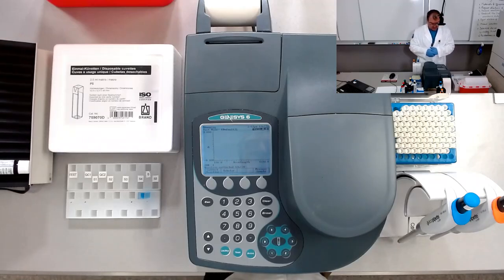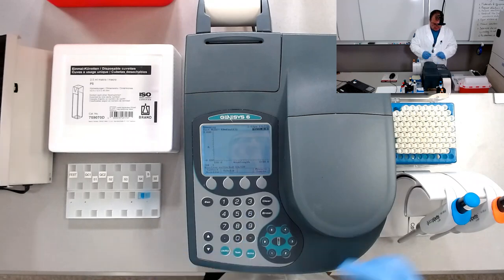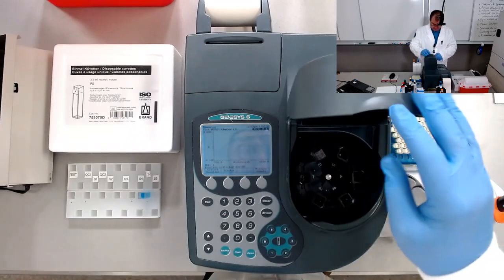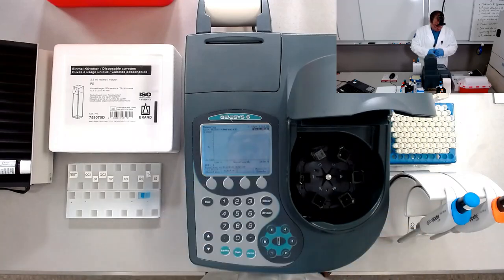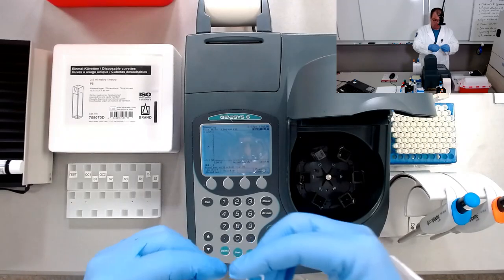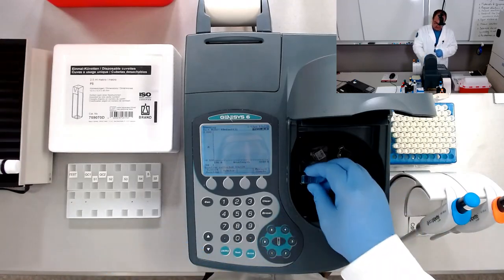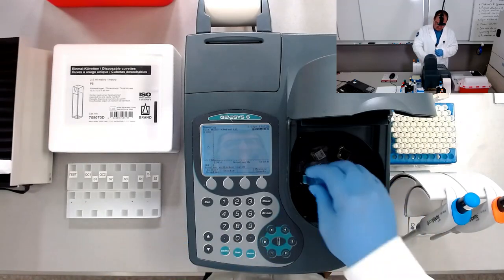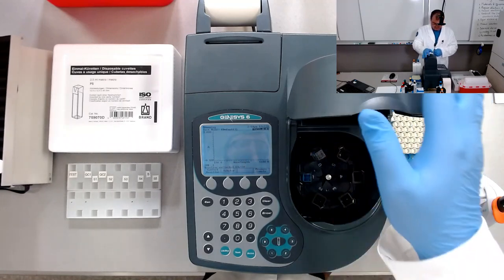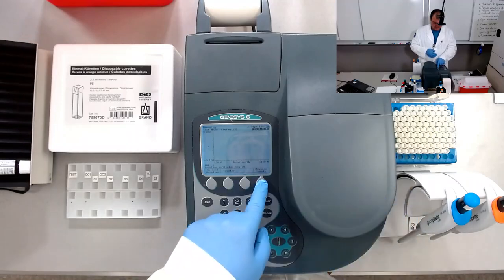Okay, so now let's measure the sample. It says that we can place the sample in cell 1. It already moved. Okay, wipe the cuvette a little bit too. So the light comes this way. So, measure sample.